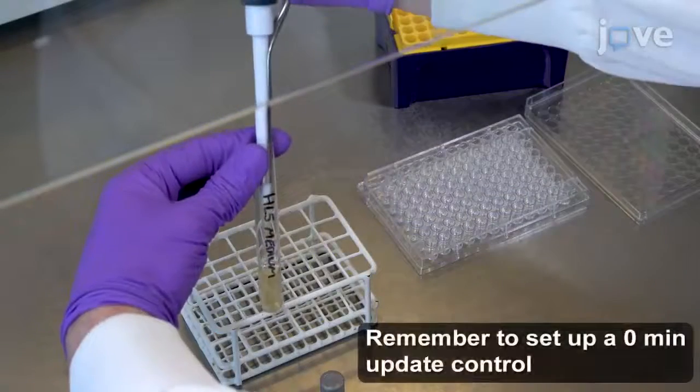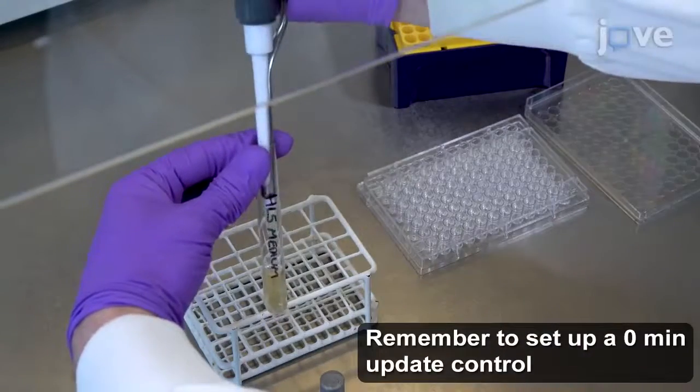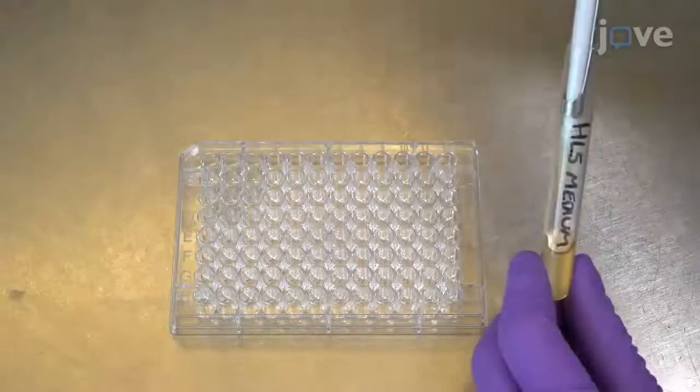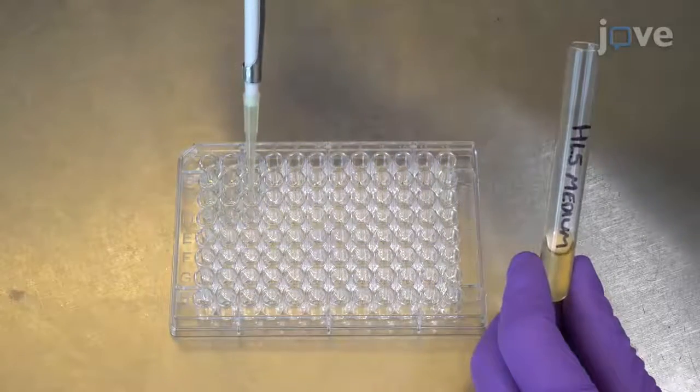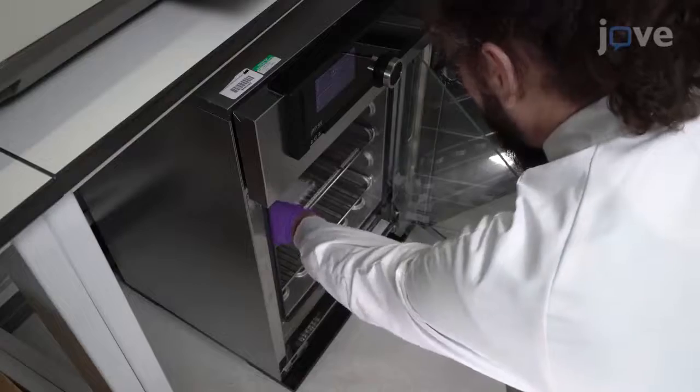Dilute the cells into HL5 medium containing antibiotics to a concentration of 100,000 cells per milliliter. Pipette 50 microliters of the diluted cell solution into each well of a flat-bottomed 96-well tissue culture plate, using 3 wells for each condition. Incubate at 22 degrees Celsius for 24 hours.